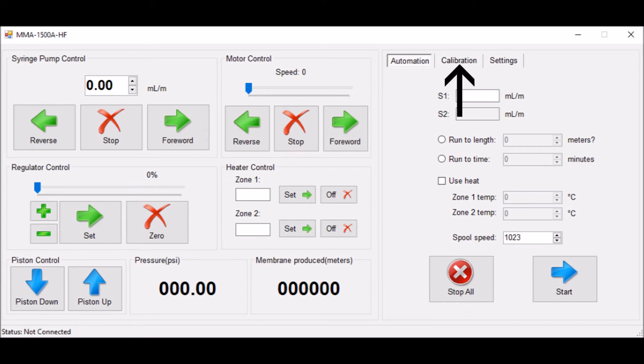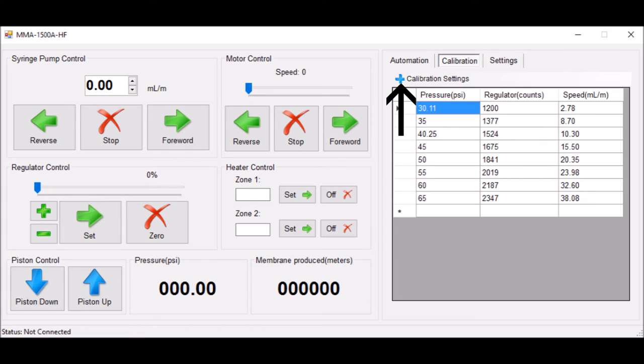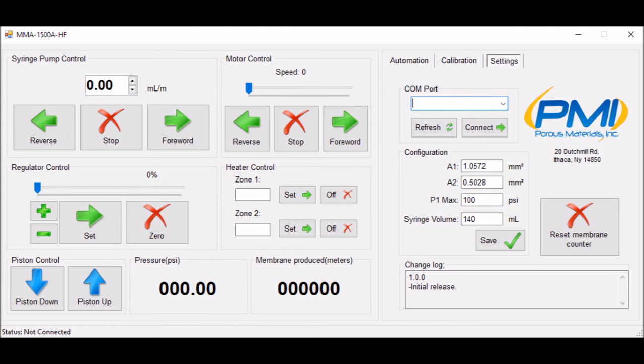If we navigate over to the calibration tab, we can control our calibration settings such as the pressure, the regulator, and the speed. Now we'll navigate to the settings tab, where we can configure and save our syringe pump settings and connect to the machine.